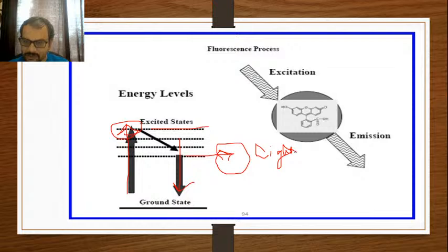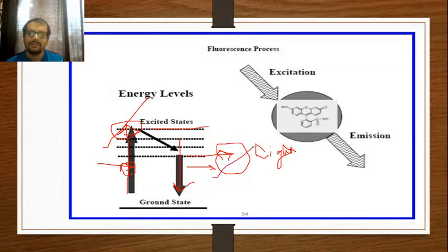When they absorb the UV light, they get excited. Now in case of UV spectroscopy, the amount of absorbed intensity or wavelength will be detected, that will form the absorption spectroscopic basis. But emission spectroscopy, or more specifically your fluorescence spectroscopy, involves the emission of absorbed energy. Emission of this absorbed energy while coming back to the ground state from the excited state forms the basis of measurement of your fluorescence spectroscopy.